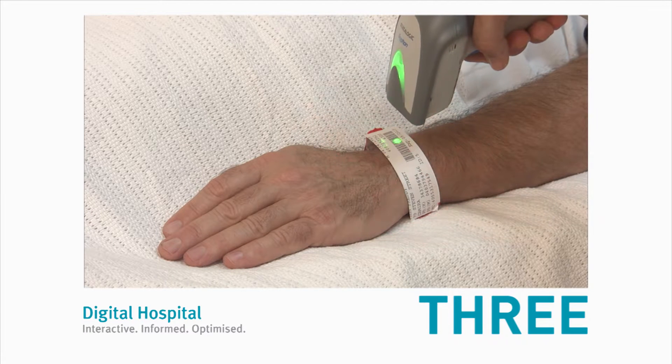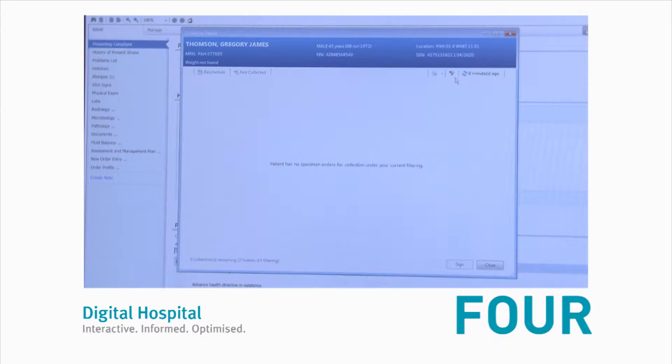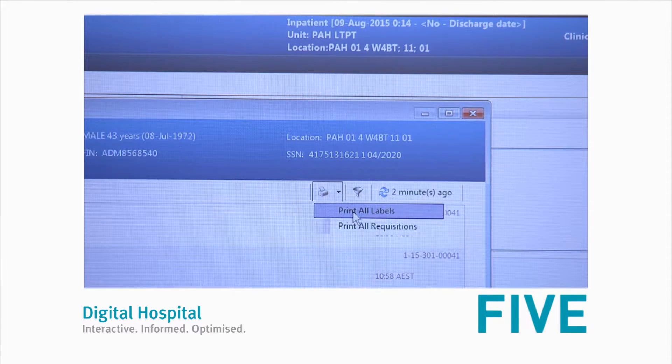Step three, scan the patient ID label or click 'Unable to Scan'. Step four, click on the filter icon to ensure that all scheduled tests are being collected. Step five, select 'Print All Labels'.